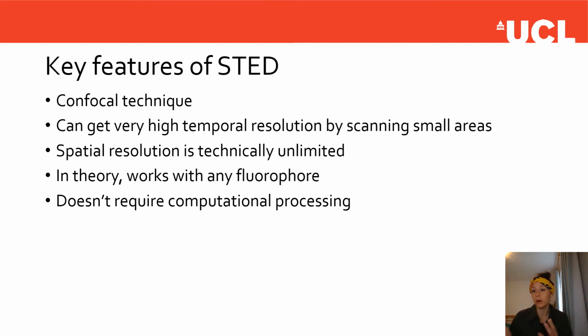Ironically, it's actually what a laser does. The acronym LASER stands for light amplification by stimulated emission of radiation. So anything can undergo stimulated emission. It isn't just a fluorescent molecule thing. Anything will STED if you try hard enough.